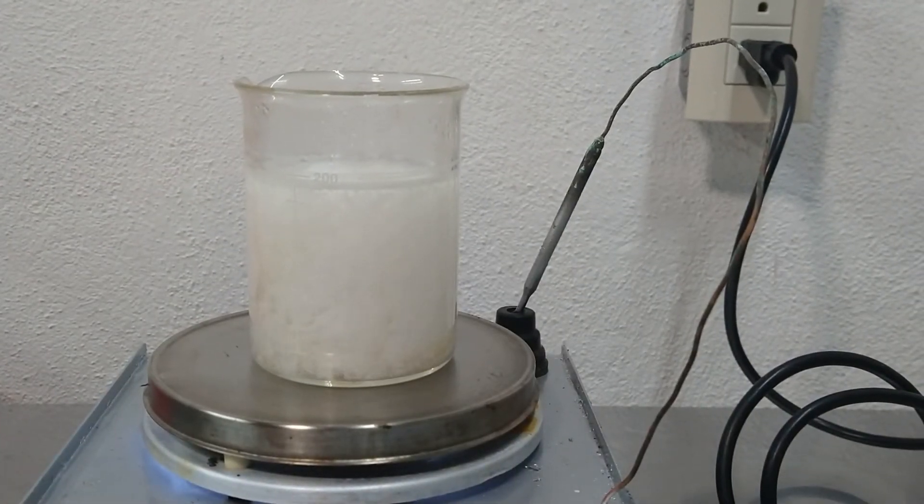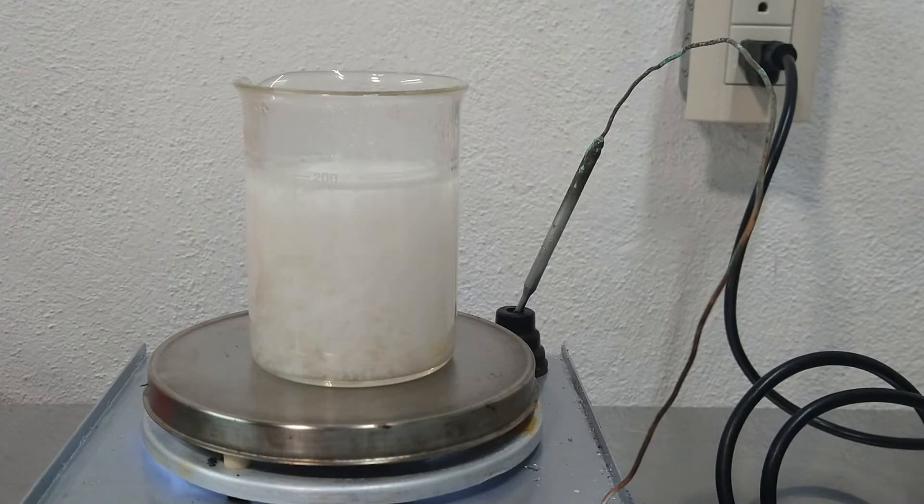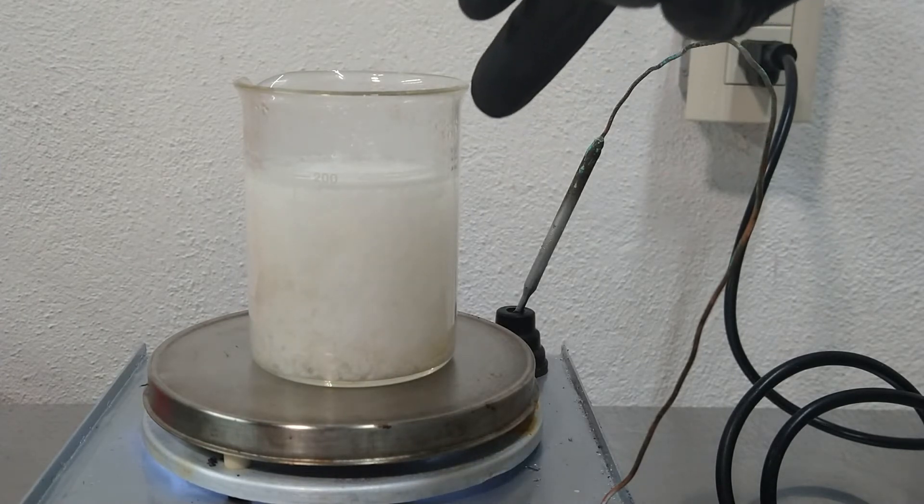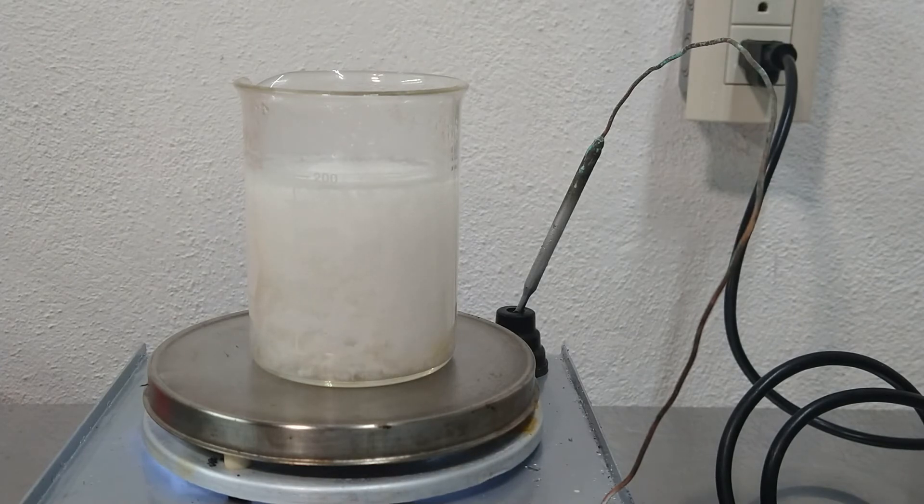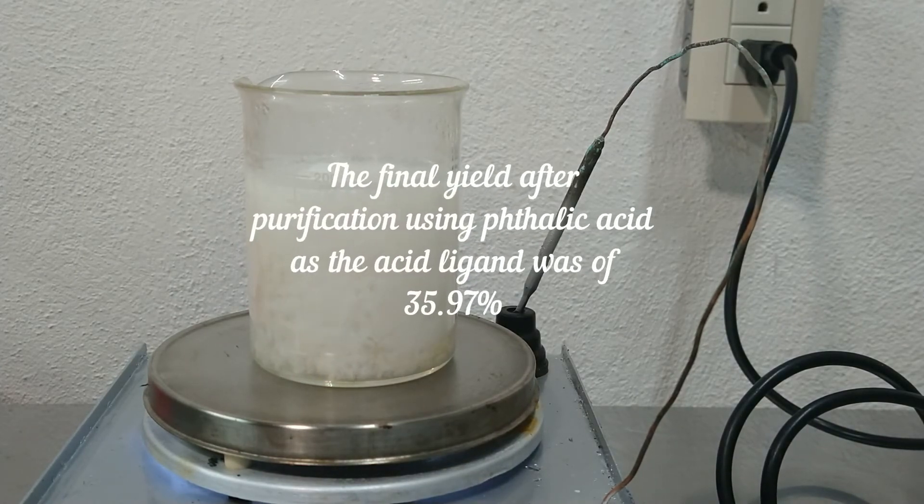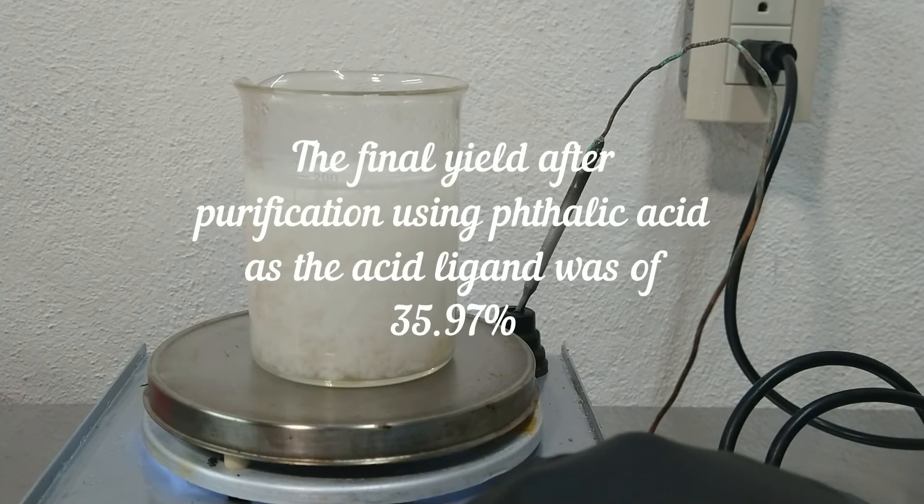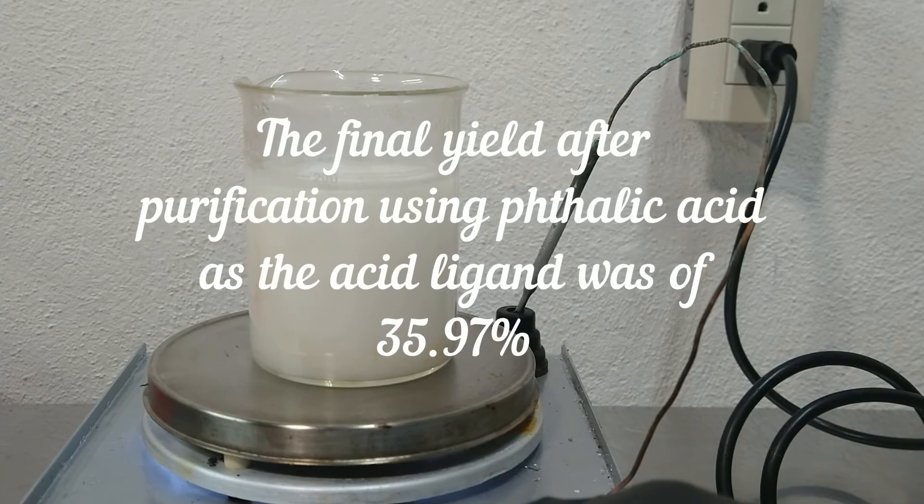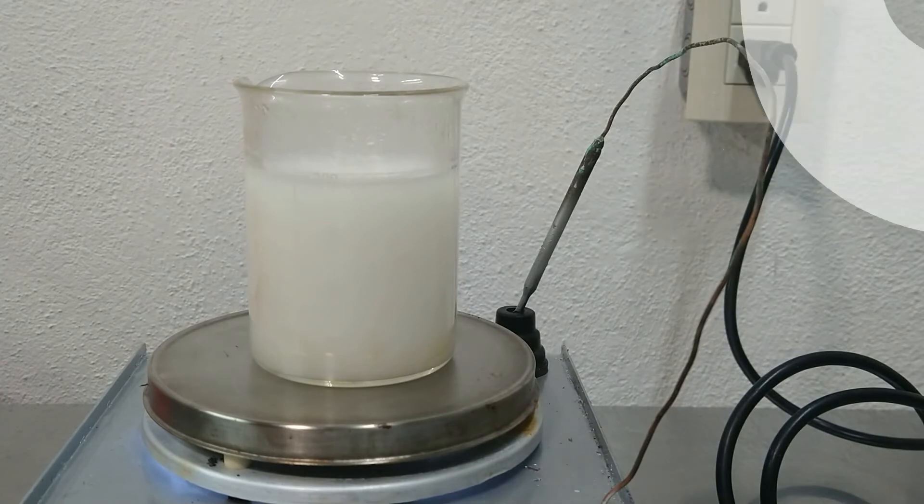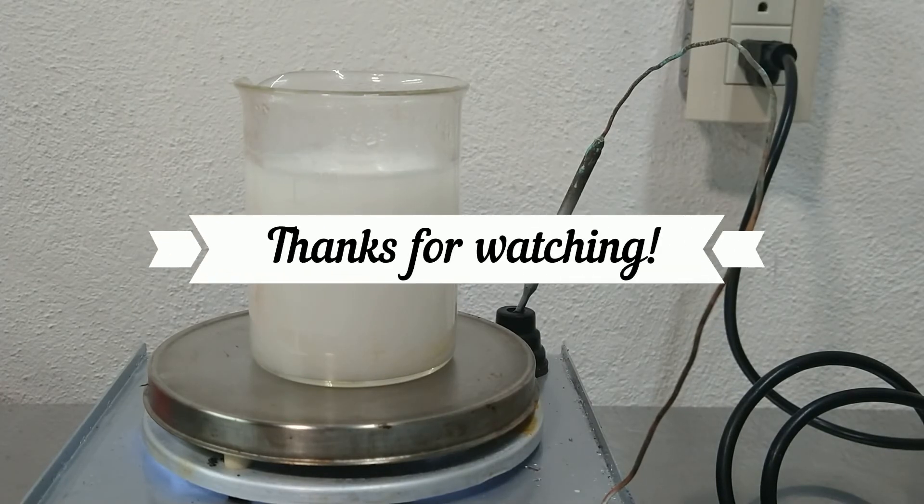And so for the last step, we need to do a recrystallization in hot water. So we add approximately 200 milliliters of distilled water and we heat to boiling and then we wait a couple of minutes until all dissolves. Then we filtrate while it is still hot and we collect the product.